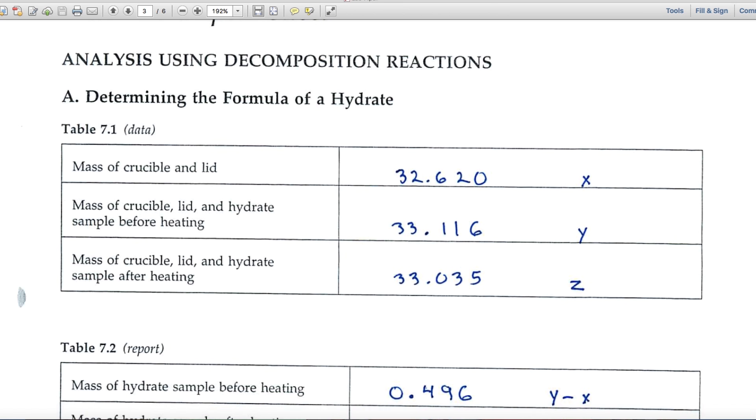As you gather data, you'll look at the photos associated with the lab. You can read the photos to the thousandth, so you'll want to record your data to the thousandth. Here's the mass of the crucible plus lid, labeled as X to help us later. Then you'll record the weight of the crucible, lid, and the hydrate sample. It will be more, and you want to record to the thousandth. Then finally, after you heat this substance to decompose it, you'll have a final weight, labeled as Z.